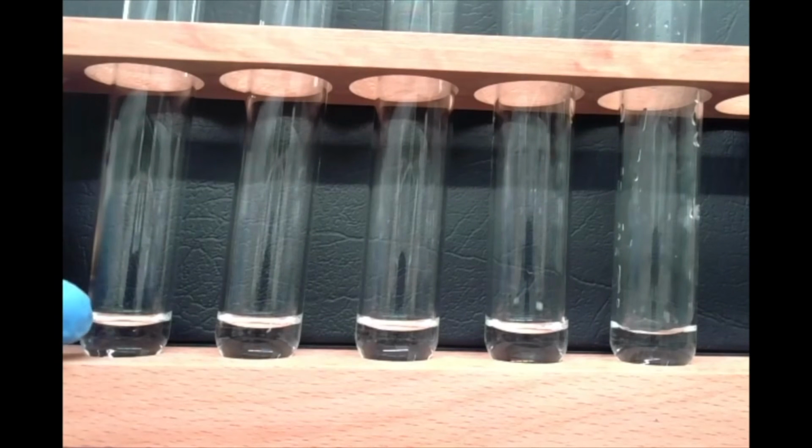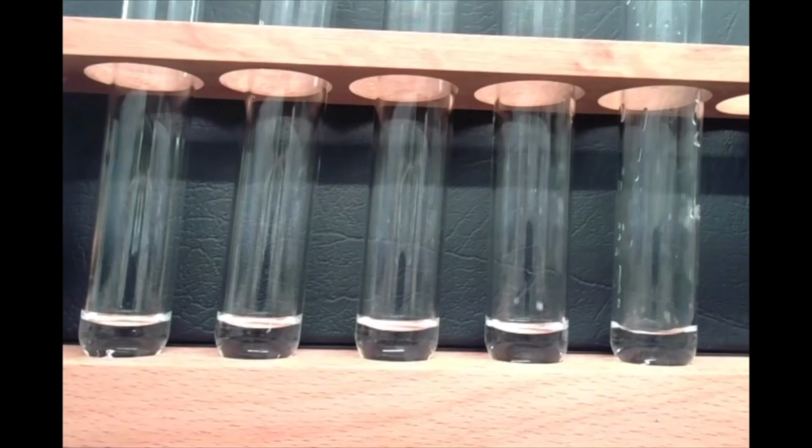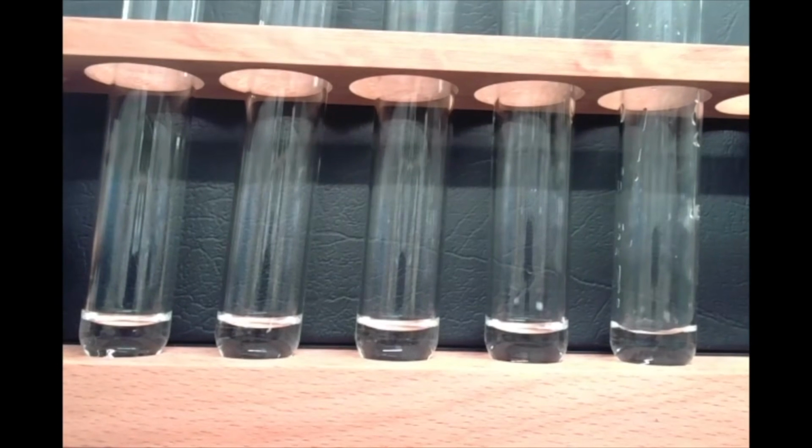Now, over here in our first test tube, we're going to use this as our reference or standard. So I'm basically not going to add anything to this. This has 2 milliliters of hydrogen peroxide, and you can see what the effect is when the reaction happens uncatalyzed. If you recall from the lab we did earlier on types of reactions, this is a very slow reaction. So even though technically this is decomposing, it is happening so slowly that you probably won't observe any bubbles of oxygen forming. It's almost impossible to notice.